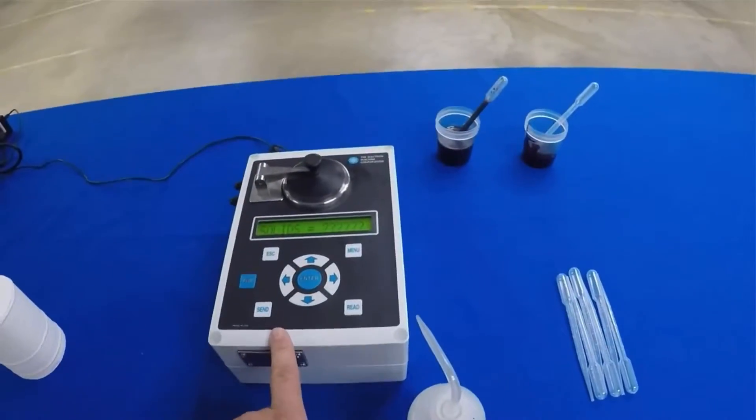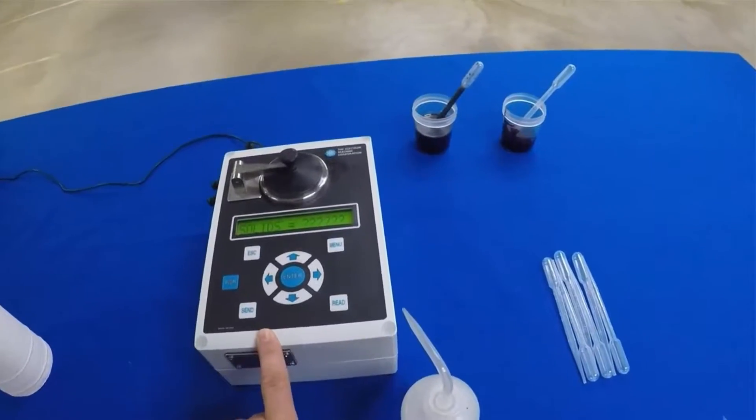Welcome back to Electron Machine. Today we are going to talk about one of our instruments, the DSA Dissolved Solids Analyzer. This is a bench-top unit used for testing various chemicals or solutions. Today we're going to test black liquor solids like we're in a recovery boiler operation room.